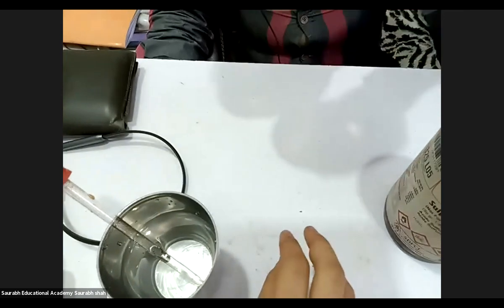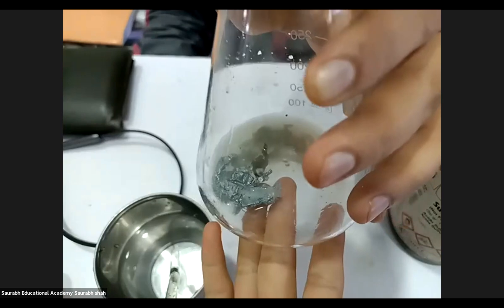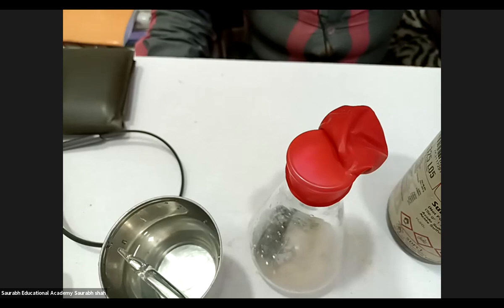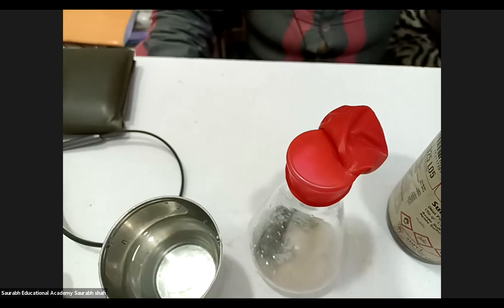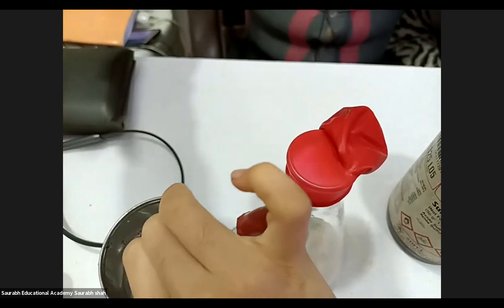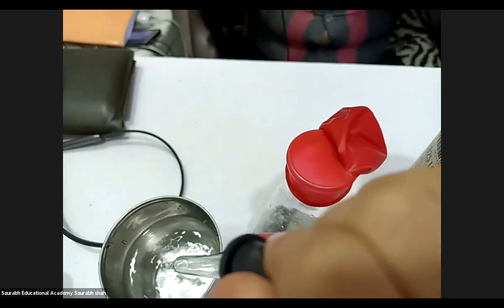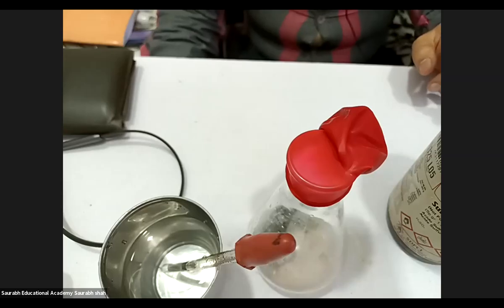As and when the reaction starts, see, it is hot, quite hot. Warm. It happens when we do this with iron. Want to show? Yes, sir. Okay. Take out iron filling. And this small container, have you done it? Yes, definitely.